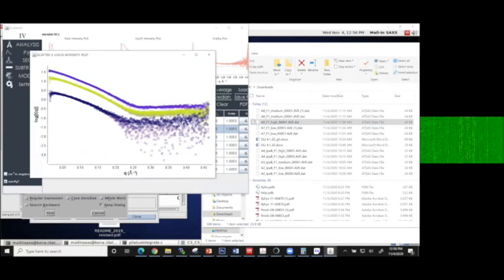And the reason that we collect 3 concentrations is to see if there's concentration dependence. So in this particular case, you will see that the proteins in solution are starting to interact as you increase the concentration a bit. And that's just because they sort of feel each other and set up a non-entirely random structure in solution. And that has to be corrected for. And in this case, it's not so bad. So that's awesome. In another case, I'll show you, it's pretty bad.